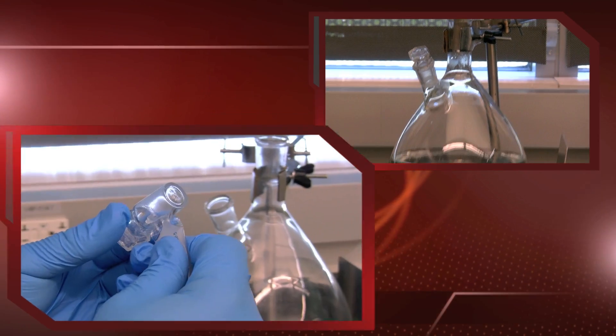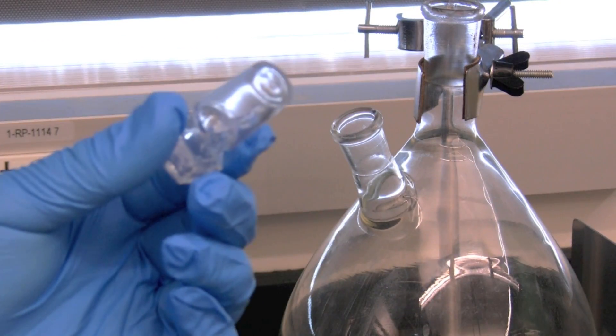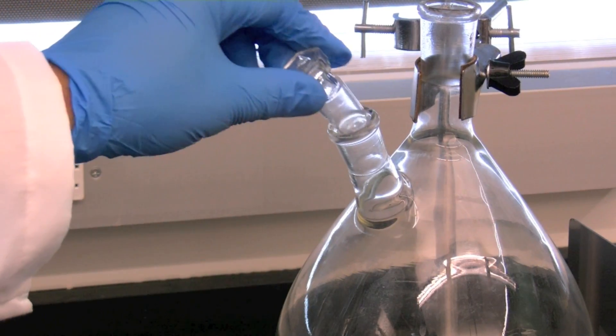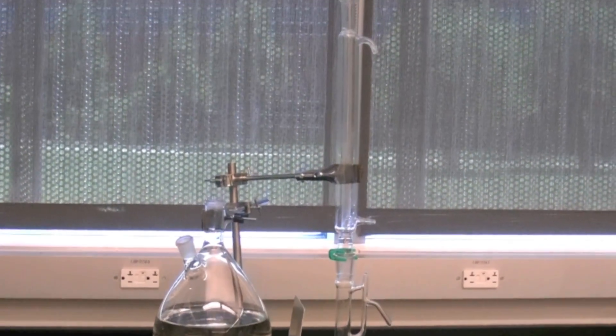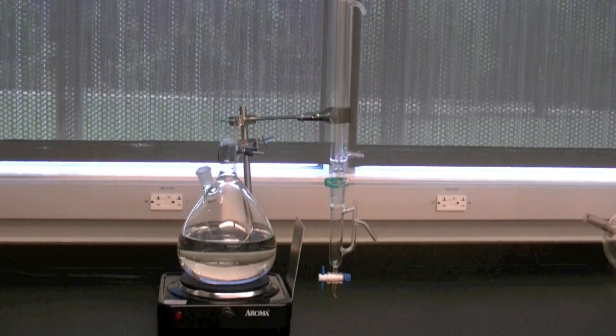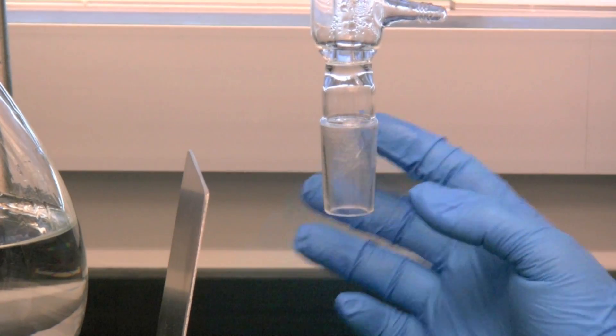Coat the boiling flask stopper with a thin layer of silicone lubricant and place it in the boiling flask. Secure the condenser in place using the second metal tube clamp such that the male end faces downward and the tube clamp is attached slightly above the water inlet connection.